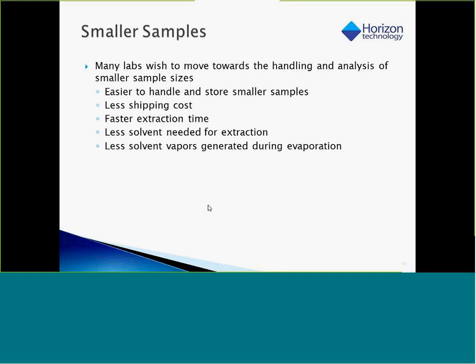And in the meetings that we had with EPA early on, there was no concern about homogeneity. One of the people brought it up and everybody said, nope, they've never seen any problems with homogeneity, so that shouldn't be an issue. Smaller samples should be fine. They are already allowed in some methods. Ones that require automatic sampling will generally only collect 250 milliliters, not a full liter. So it's entirely possible that we'll all move towards smaller samples in the future.